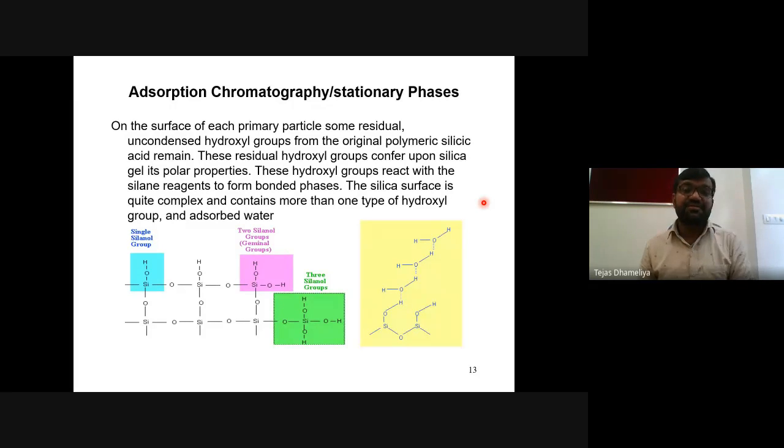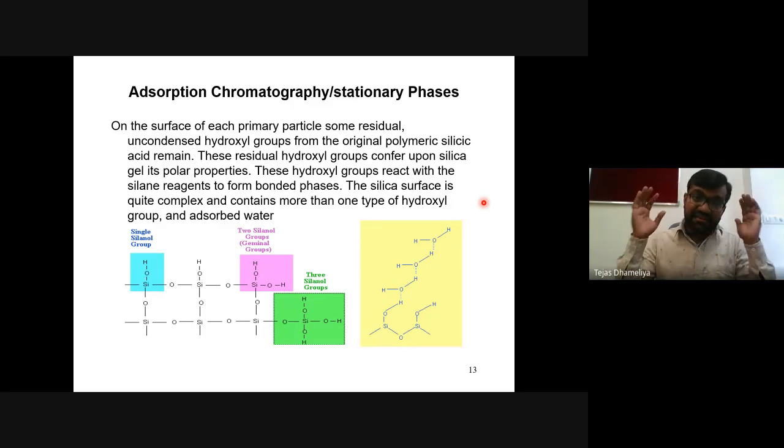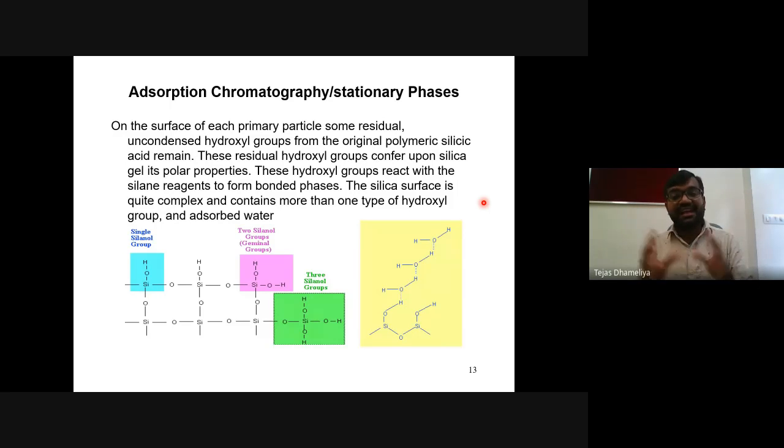So under these circumstances, it is very necessary to make the silica gels active. There are also ways to activate the silica, where people heat it at a certain temperature, or dry it in an oven, or sometimes use desiccators to absorb the moisture and make them active.